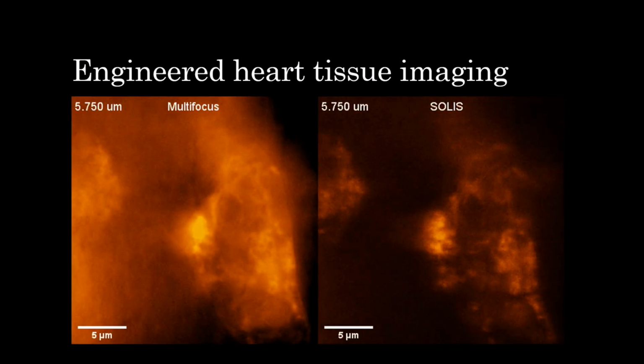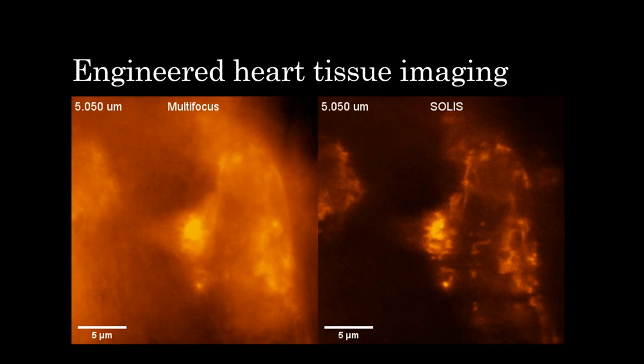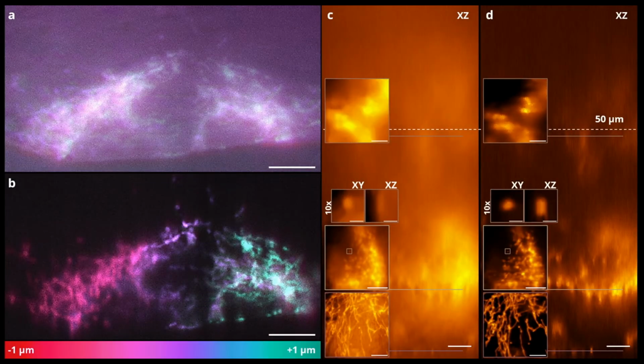Every one of these planes that I just showed you in the zoom through is actually a 2 micron thick volume that displays the mitochondria. And if we have a color-coded view, then you can really see in a single cell, in one shot, you can assign all the mitochondria in a cell to exactly the set position where they are within the resolution limit of the system, which is about 500 nanometers. And that works actually quite deep into the tissue.